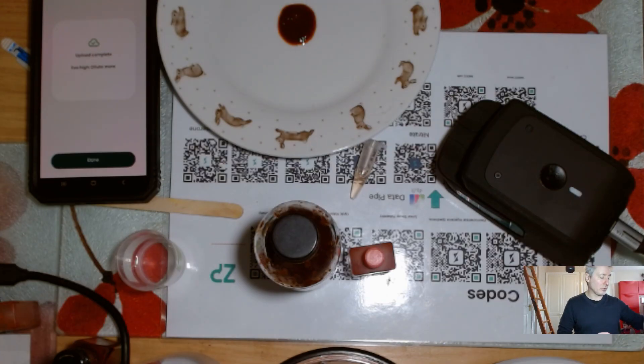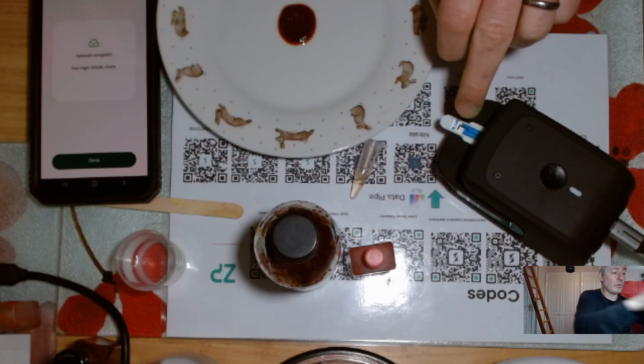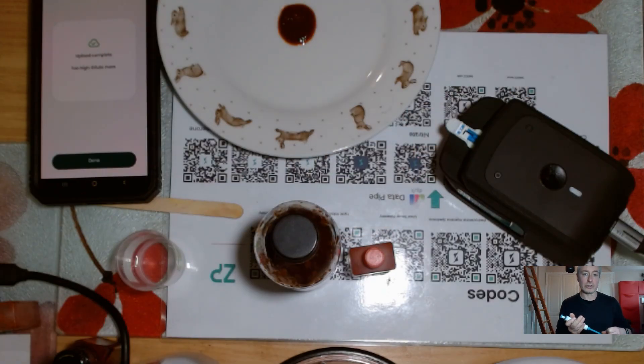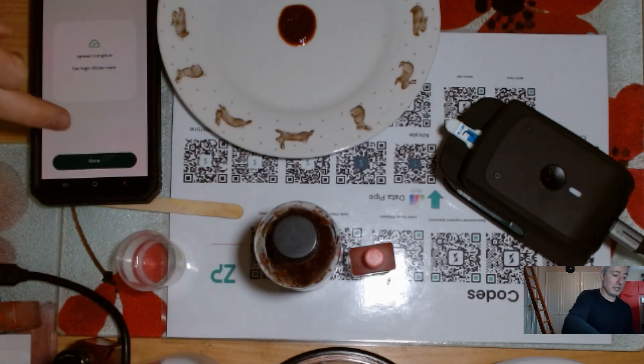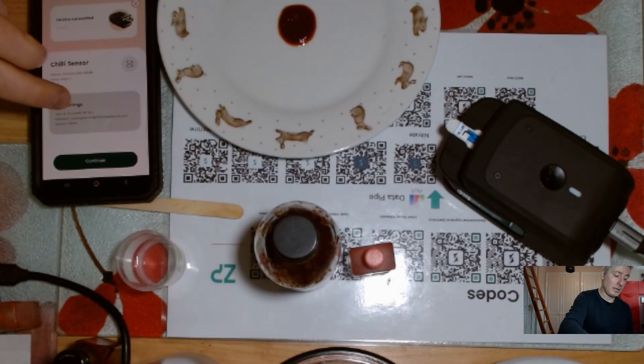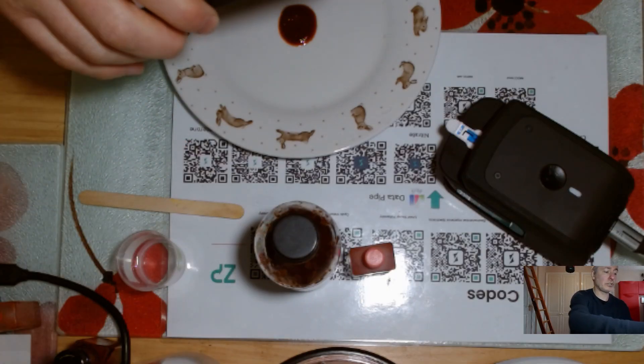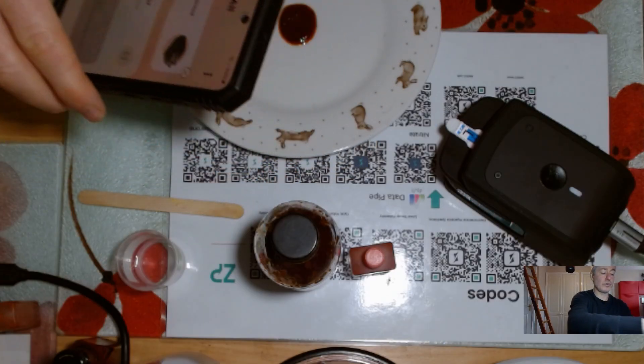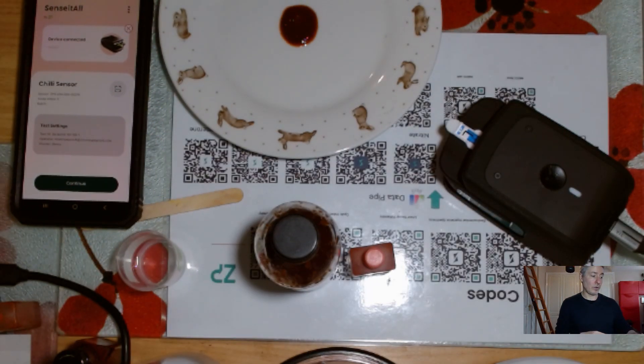I'm doing this quicker than I would if I were doing a more analytical approach, but I'm really just trying to demonstrate the overall workflow of this system. I'll put a clean sensor in. You do not need to do these serial dilutions by the way — if you're trying to make a hot sauce, you know one-in-ten is never going to be enough; you can just go straight to one-in-100. I'll name the sample in the app, changing it from '10' to '100' so I can identify it later.